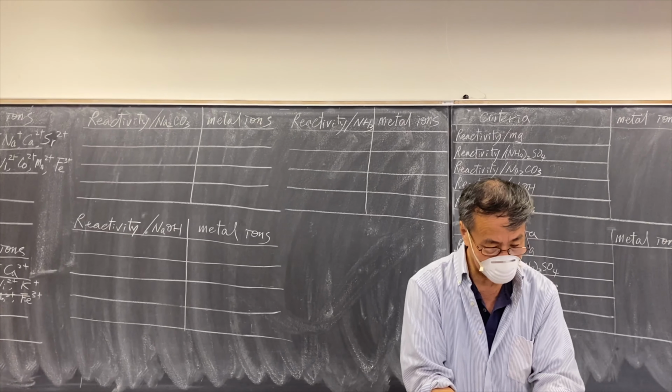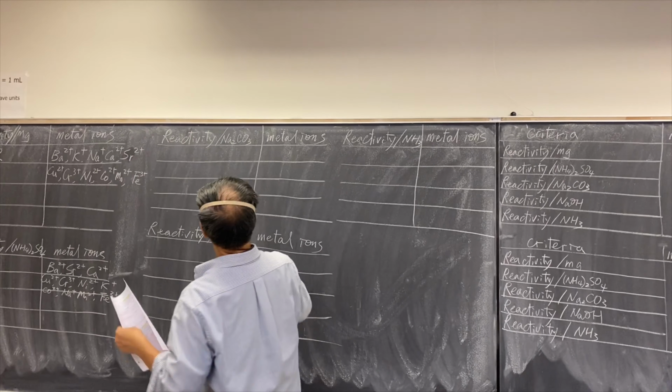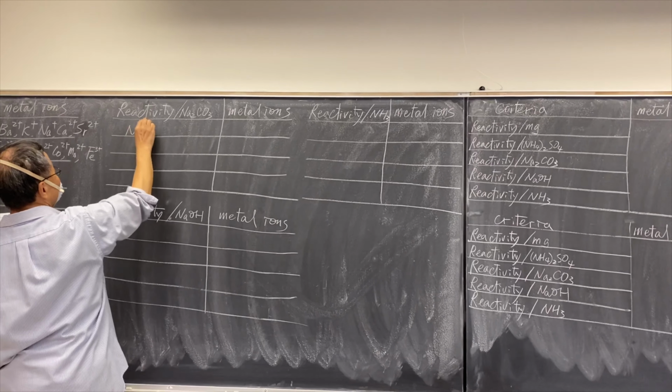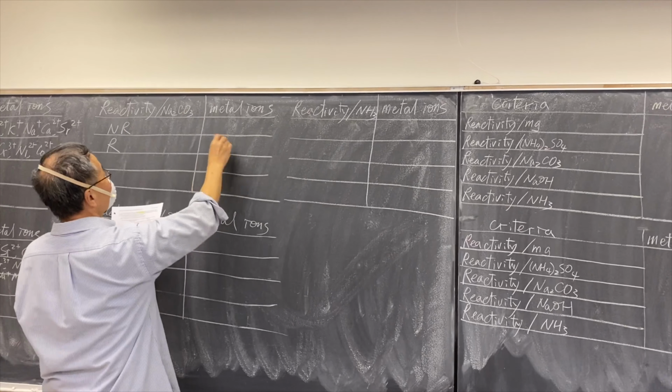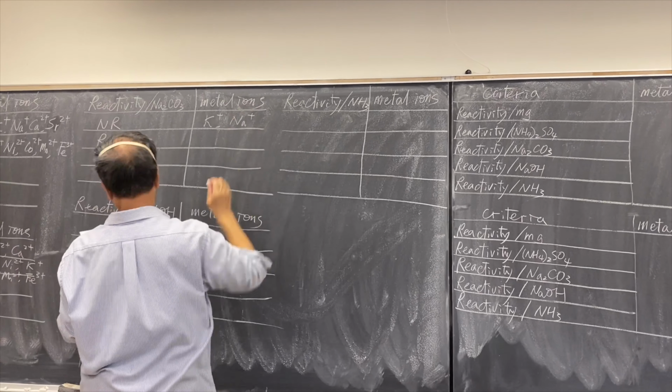And the third one is reactivity with sodium carbonate. Same thing, no reaction first and then reaction. All right, so now no reaction, we only have those two.